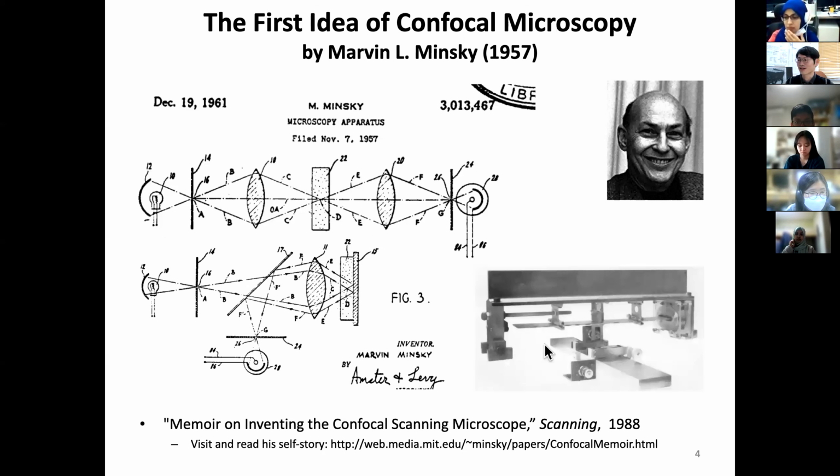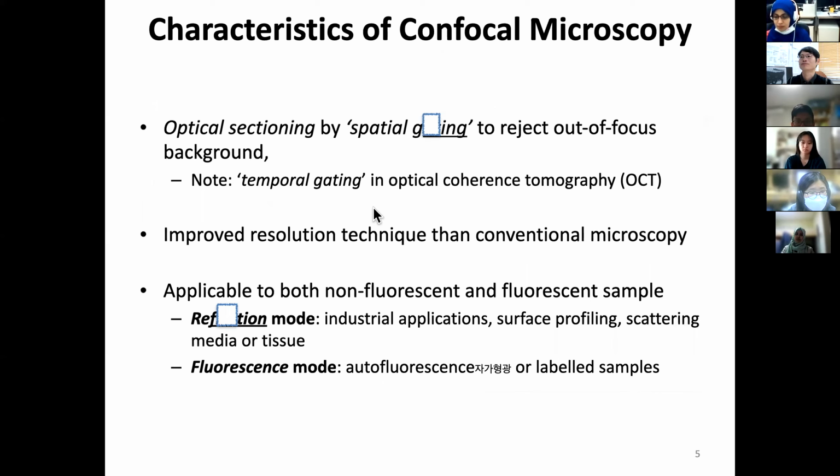So here is this one. This is the confocal microscope he built. In fact, he was the first to use the visiting machine shop in the university, using a milling machine to make this. So I strongly encourage you, whether you're a computer scientist or a molecular biologist, it doesn't matter. If you want to do something, you've got to learn how to build something, how to grind, how to make a hole. I think this is a really important practice and lesson from him.